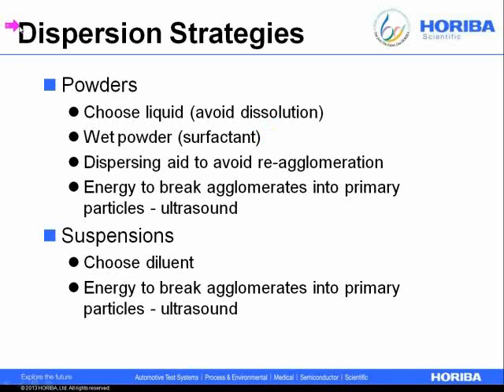So what are some strategies, or how do you think about making dispersions? Well, if you have a dry powder, your problem is a little bit tougher. You have to decide which liquid you want to put your particles into. You don't want to put your particles into solvents. So if, for example, I have polystyrene latex and I put it into DMF, I could wind up looking at something quite different than what I think I'm looking at. That's because the DMF will dissolve polystyrene quite nicely and take those latex particles and more or less separate them and swell, at the very least swell them, and quite likely separate them.